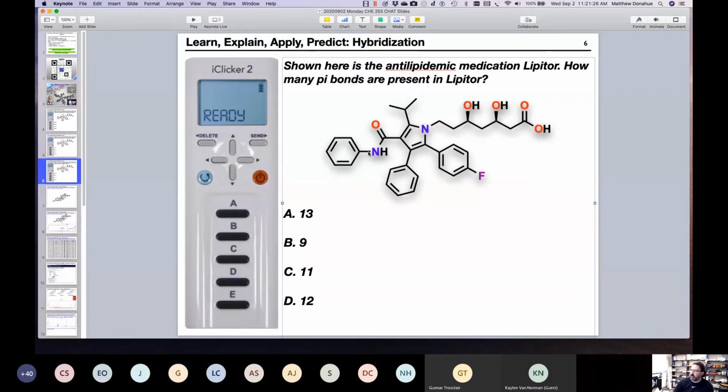This is bonded to nitrogen. This is bonded to a carbon. And then this is bonded to a carbon. So those rings are in different environments. Look at this pi bond. What is this carbon-oxygen? What functional group is that a part of? Maybe in the chat box you can write your answer.